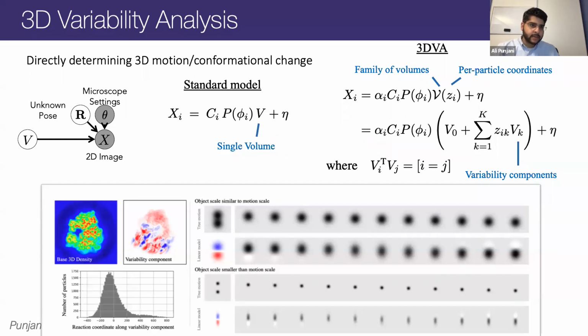It depends on many, many factors, but you can have particle sets that are sufficient to generate a single static structure, even at a moderate resolution, but not sufficient to resolve 3D variability components. Typically, I'm thinking you need hundreds of thousands or more particles most of the time to get good results, although the example data set that we're going to work with today has about 40,000 particles, and it's good for resolving 3 variability components.